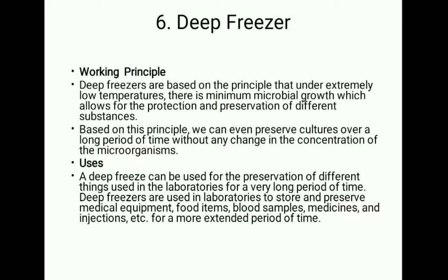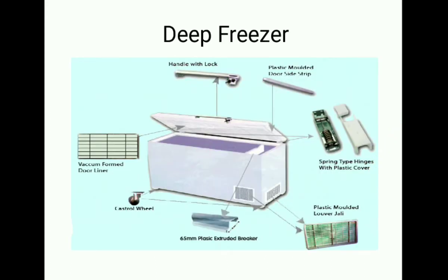concentration of microorganisms. Talking about the use, a deep freezer can be used for the preservation of the different things used in the laboratory for a long period of time. Deep freezers are used in laboratories to store and preserve medical equipment, food items, blood samples, medicine and injections, etc. for a more extended period of time. So this is a deep freezer.